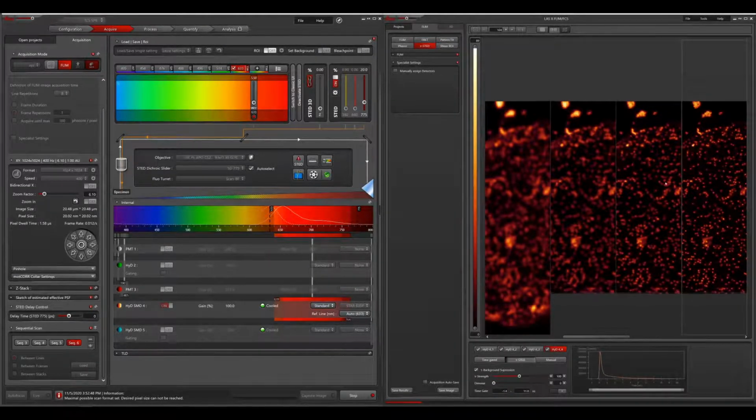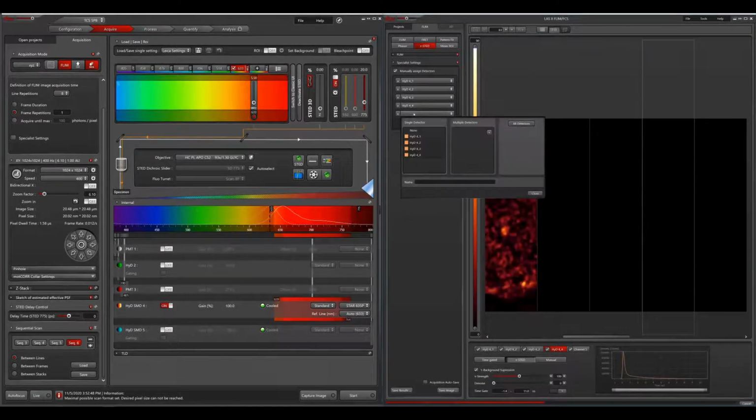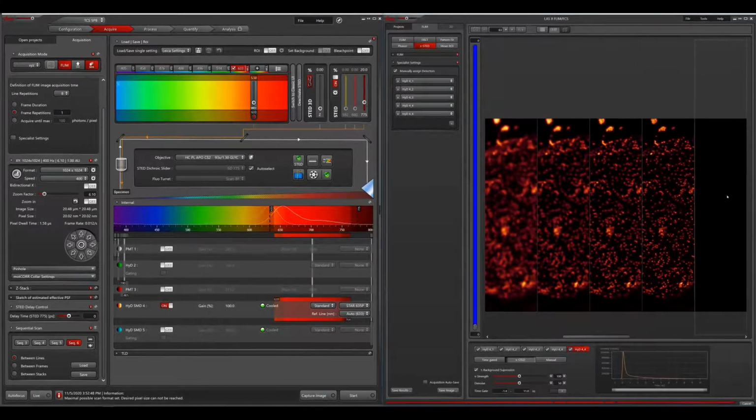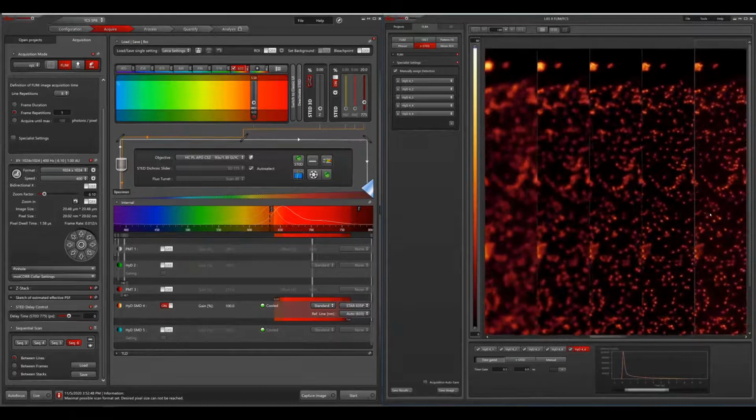What we can already see from here. So this was our initial settings. This was at 7%, so 1/3 of the depletion laser power. And this was at just 2% depletion laser power, which is then just 1/10 of our initial setting. But now let's compare what we could have done with classical gated STED here. I will just add one more channel, which should be the gated one. 0.3 is a gate start. All right, and now let's look into our results here.